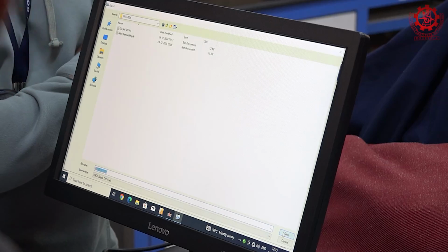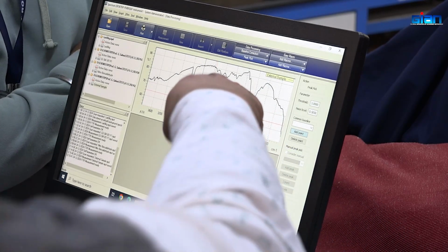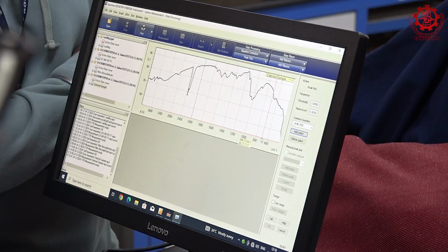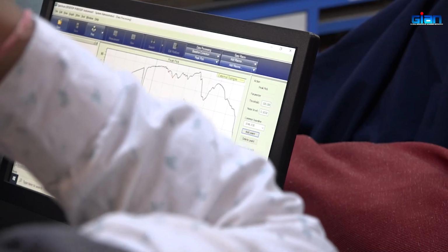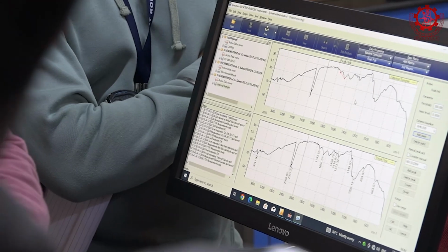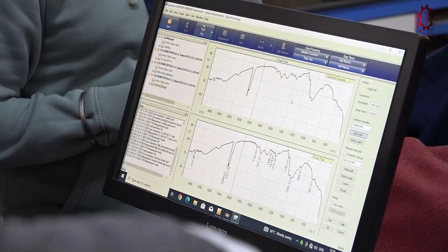Yes, if you compare the earlier two spectra and this spectrum, it is not clear, right? There were sharp peaks, but here the peaks are not sharp. So from this I can definitely say whatever molecule this is, it's a huge molecule. Huge molecule means it has so many bonds, maybe thousands or 10,000, 20,000 bonds, and all those 20,000 bonds will absorb. That is what leads to merging of several peaks.